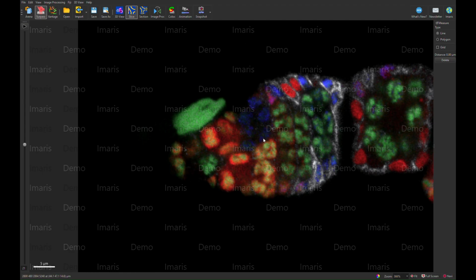Okay. Got red and green and blue colors here, and every combination therewithin. You can see a green cyst here, a red and green cyst there, and in white we also have stained a Fas3 protein, which surrounds the follicle cells and the region 3 cyst on the posterior end of the germarium. Take you through the slices here.